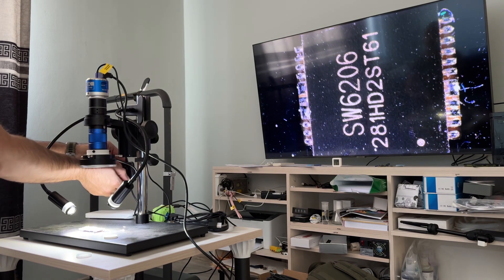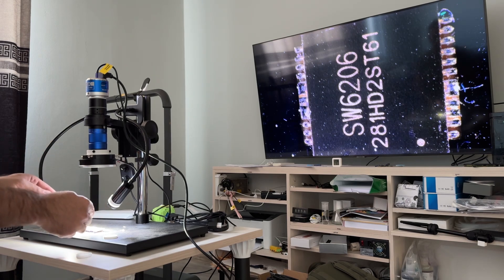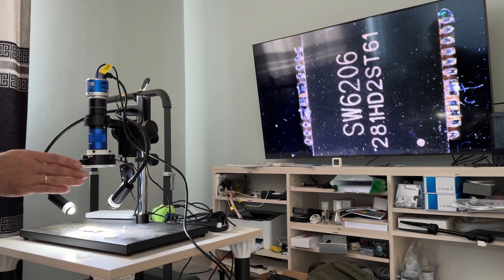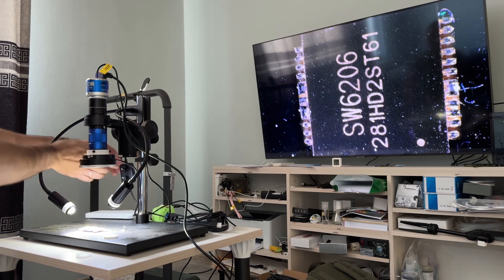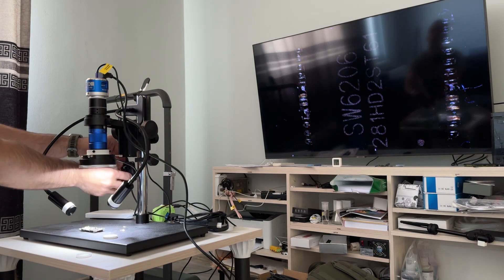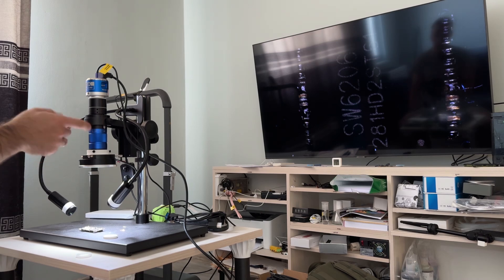With two light sources — now we have two light sources. And you can see before, with only one light source, how dark it is. How dark it is — it's a cheap lens, and it's dark.